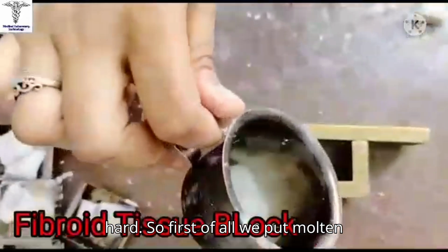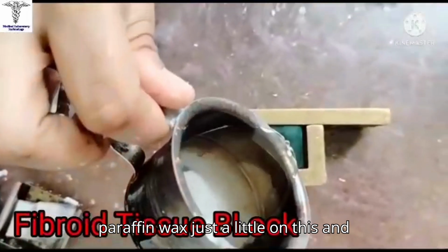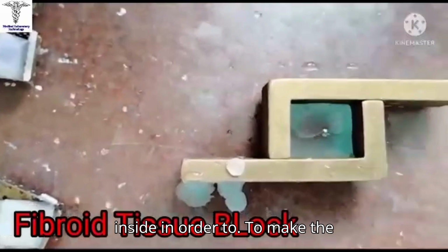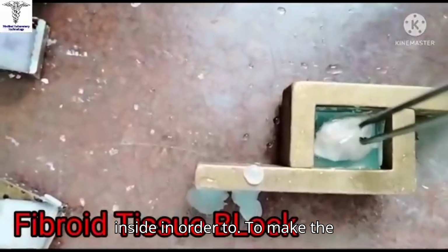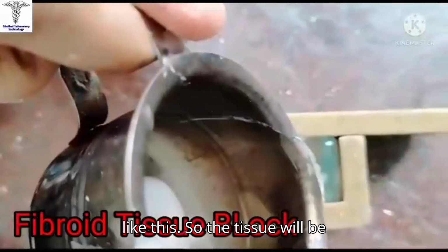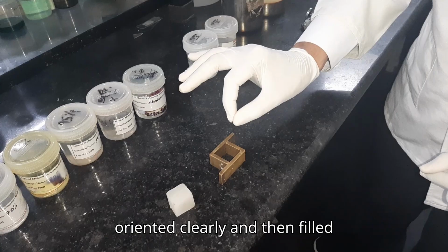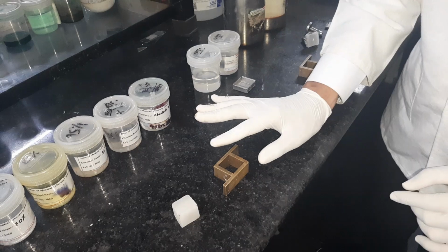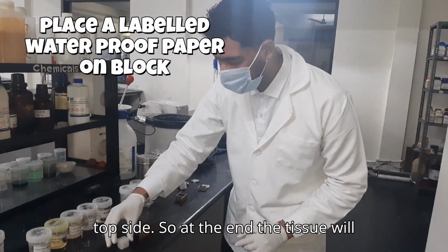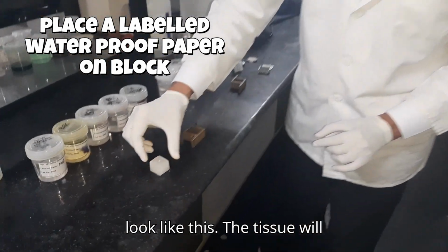First we put a little molten paraffin wax, and then we put the tissue inside in order to make the proper block. The tissue will be oriented clearly and then filled with the molten paraffin wax until the top side.